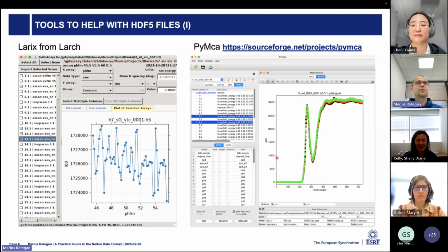From what I use PyMCA, even in the past for spec, was always opening them one at a time. And then you have this drop-down menu that is also visible here, which essentially allows you to switch from one to the other if you want to open more than one file. Right, right. But usually for an experiment, you get one spec file per experiment, right? So in HDF5, I assume you get one HDF5 file per scan. No, actually, we have one HDF5 file for what would be a sample.